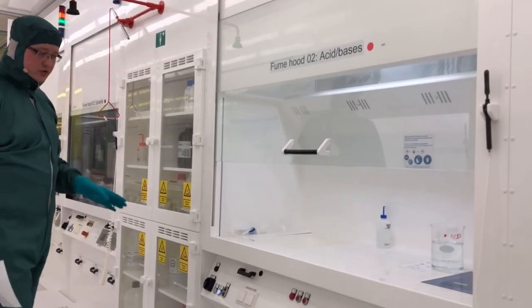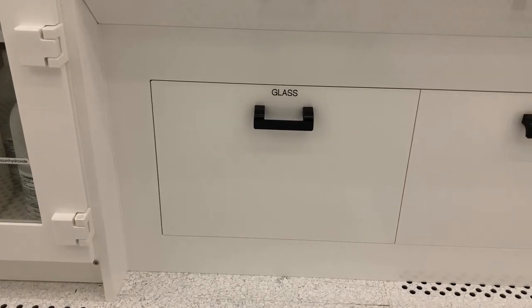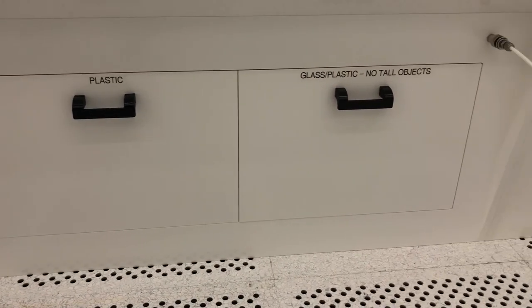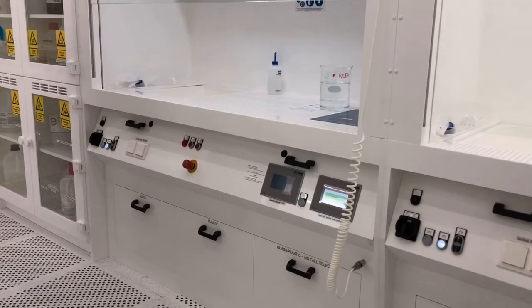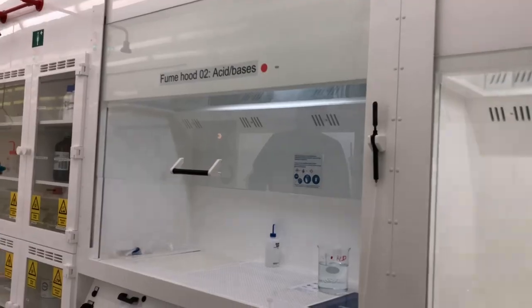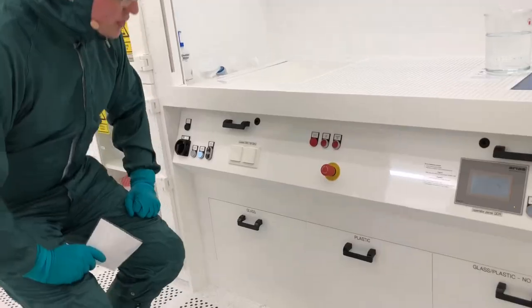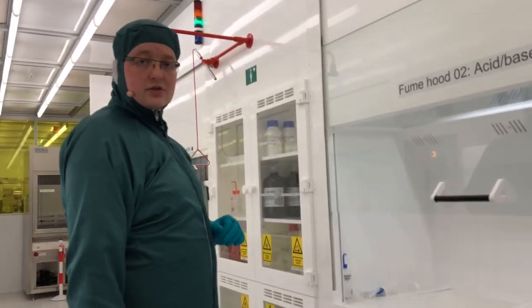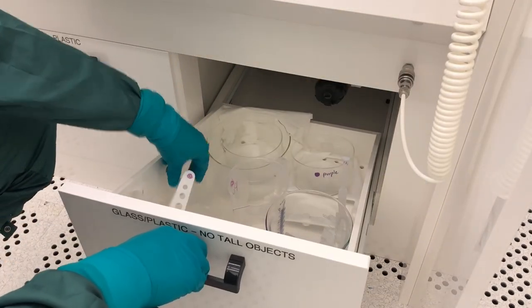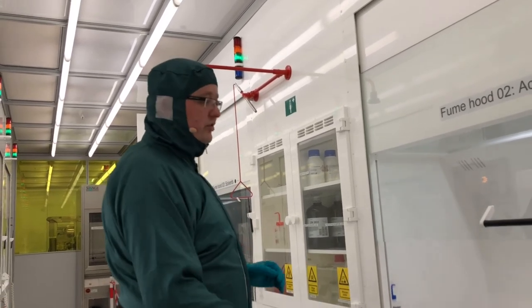All fume hoods have drawers at the bottom where you can find glassware, plasticware, beakers and thermometers for your process. Check the labels and place beakers correctly, observing the color coding of the fume hood and glassware as mentioned earlier. When you are done using glassware or beakers, rinse them and put them back in the drawers even if wet. Leave them to dry in the drawers so the fume hood is clean and tidy for the next user.